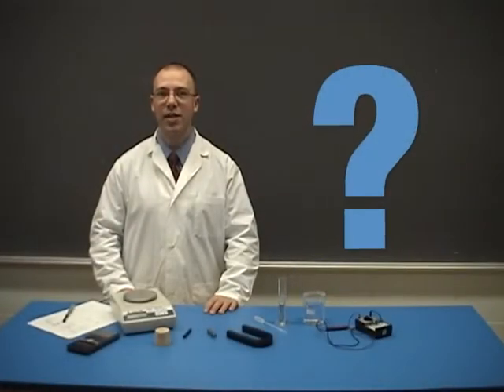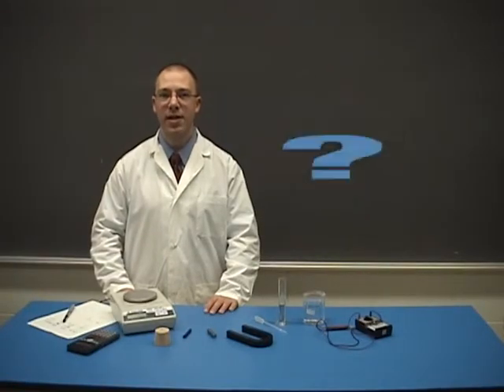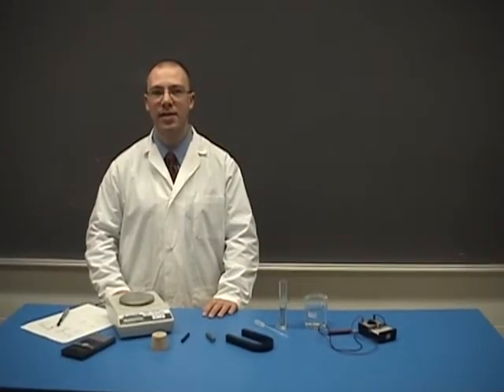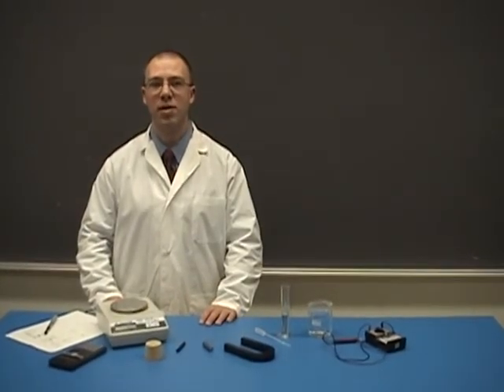How are we able to identify the various solids in this lab? Create a hypothesis explaining your observations. What characteristic properties do the solids in this lab display? Hopefully you will now be able to conduct tests to identify the characteristic properties of various solids using the procedures in this video.